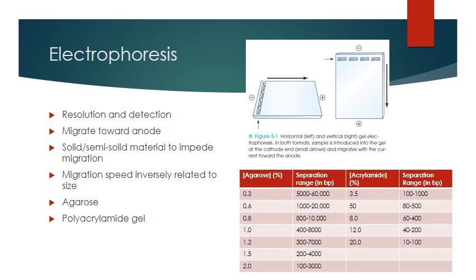Now each nucleotide has the equivalent of one negative charge, and so your charge to mass ratio of the various sized molecules will remain constant. So that means that the DNA fragments will migrate solely based on their size, and their charge won't come into it, since the charge won't change as the size increases. So this allows us to separate the DNA sequences based on size.